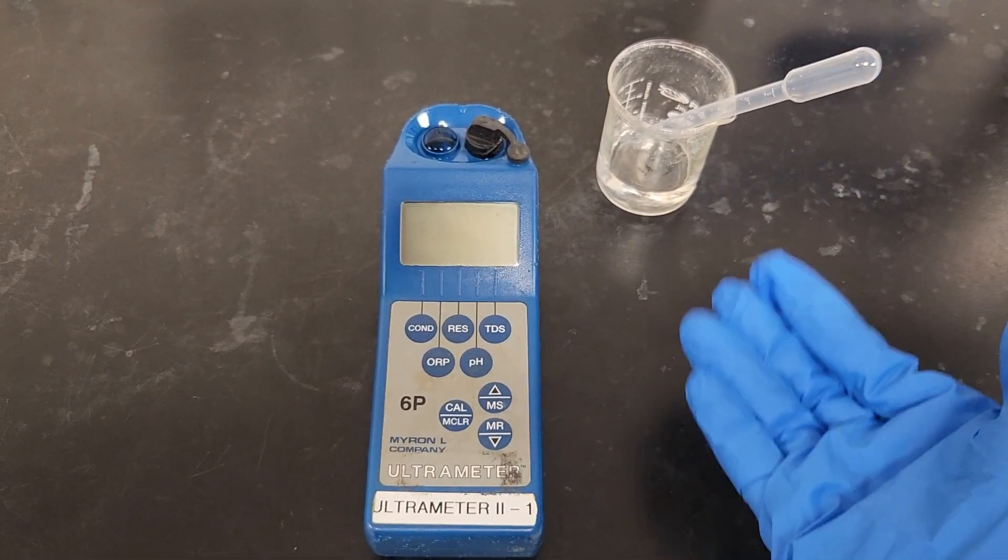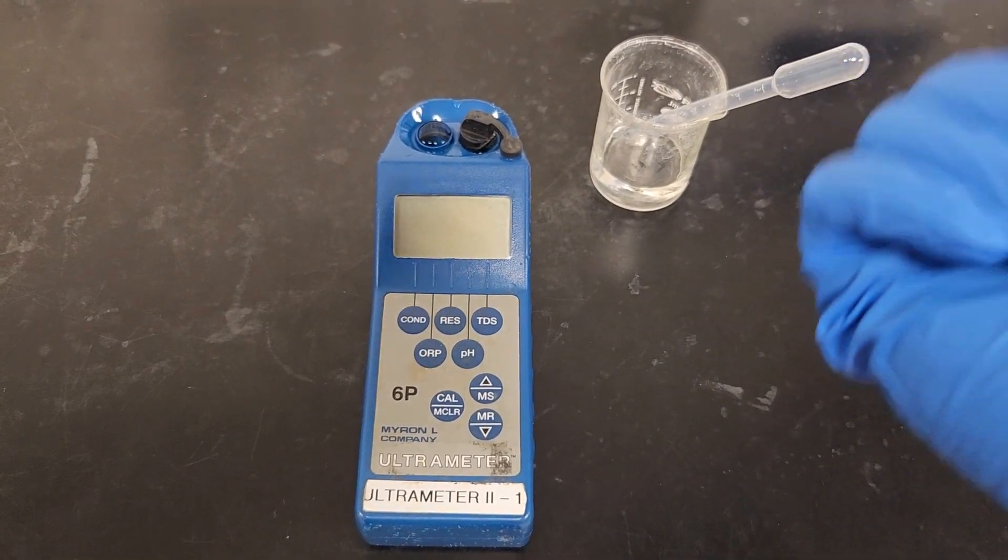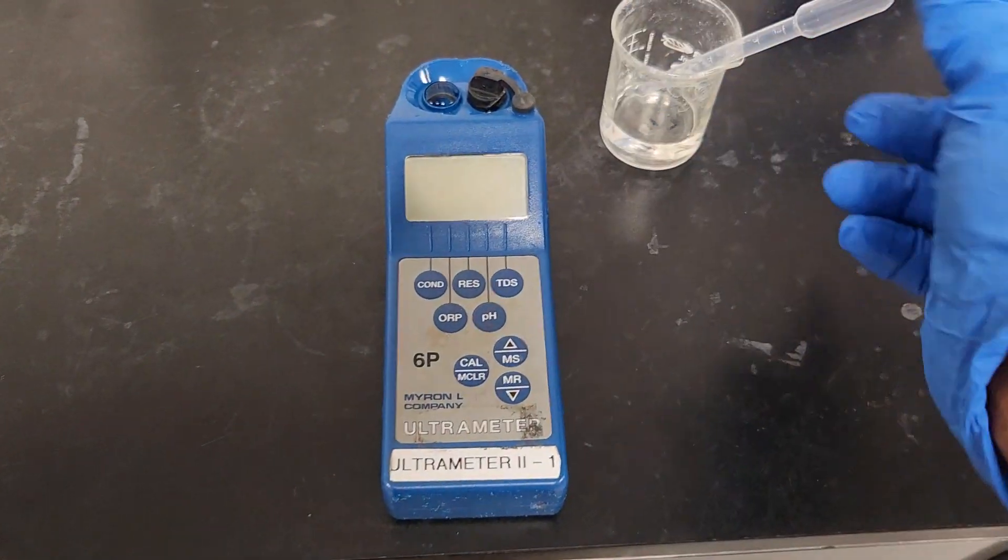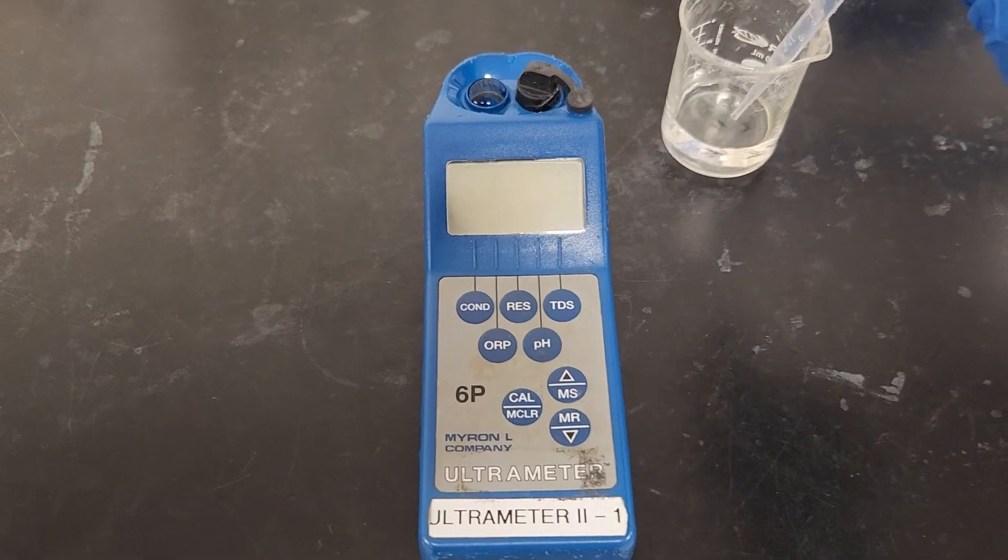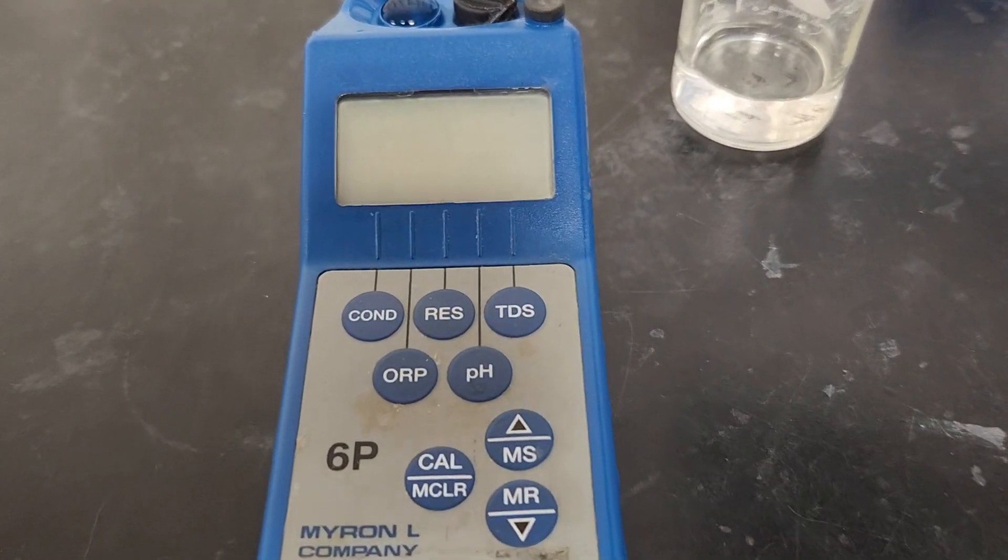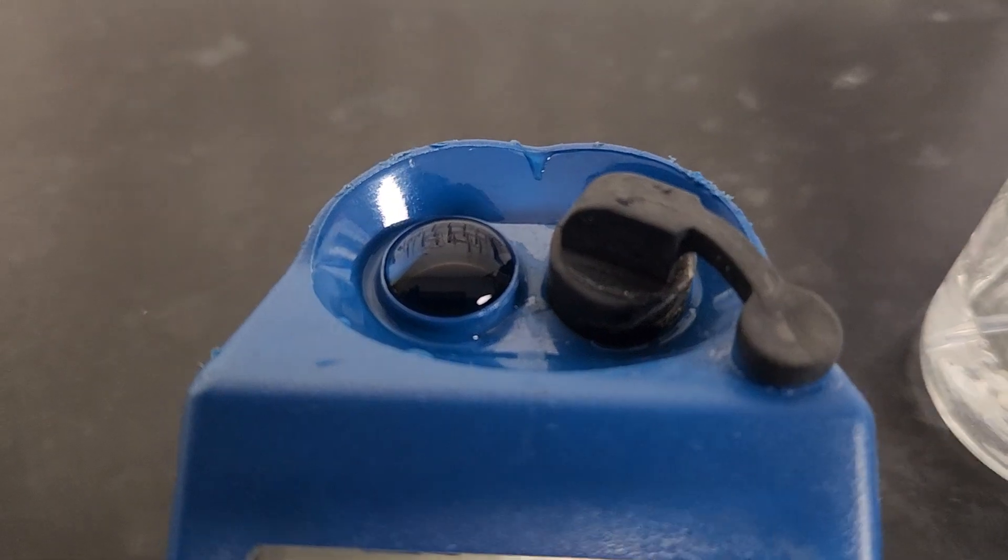So now I already have the sample inside ready. I just use the pipette and try to make sure there is no air bubble in the water that you're measuring, in the sample you're measuring.